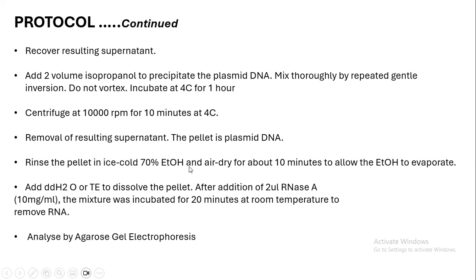We rinse the pellet in 70% ethanol and air dry it for about 10 minutes so as to allow the ethanol to evaporate. We then resuspend the pellet in TE buffer or sterile distilled water, about 10 microliters of which can be used. We can also treat with enzyme RNase to remove RNA contamination, and then we'll analyze the gel by agarose gel electrophoresis.